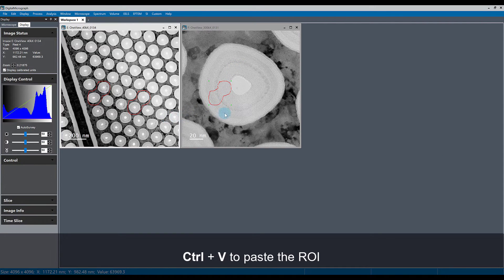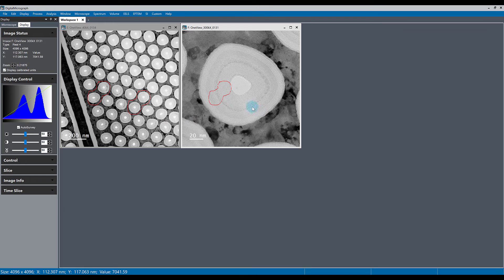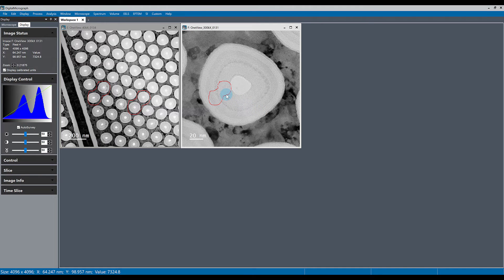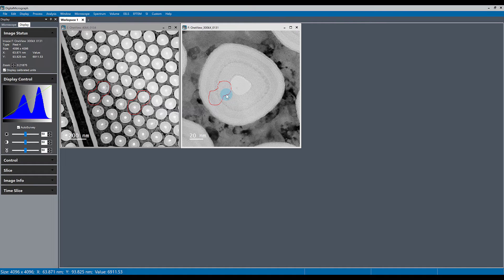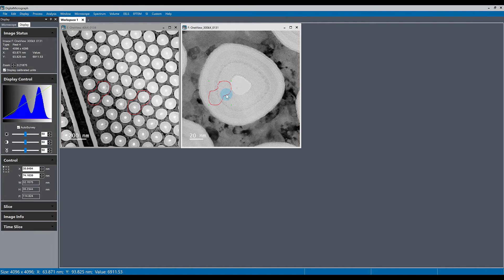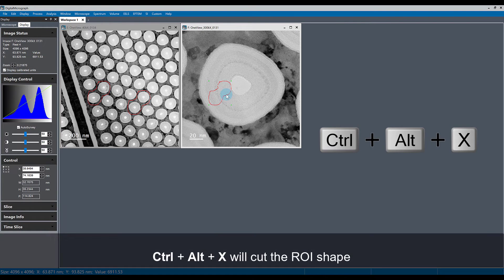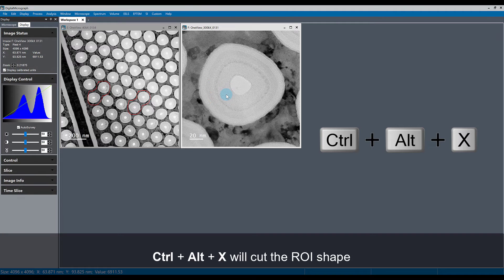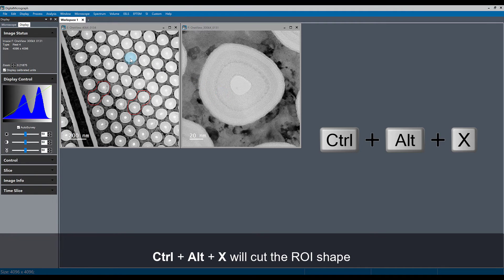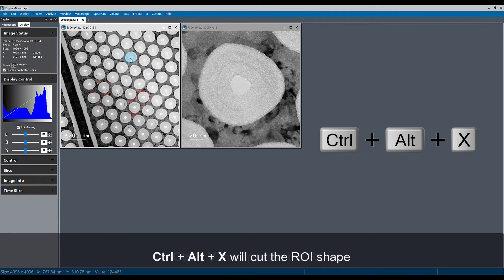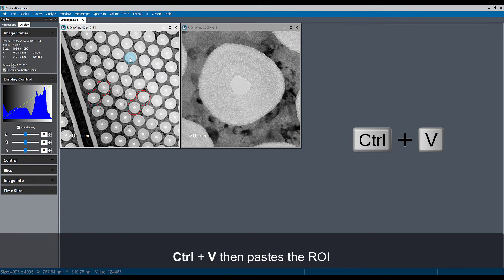If, for example, we want to cut an ROI and paste it into a different image or a different area of the image, a different window, we can use Ctrl-Alt-X to cut it and then select the window we want to paste it into with Ctrl-V.